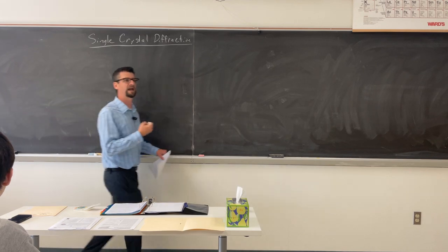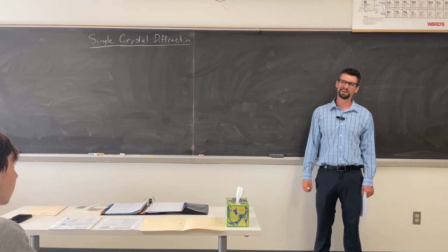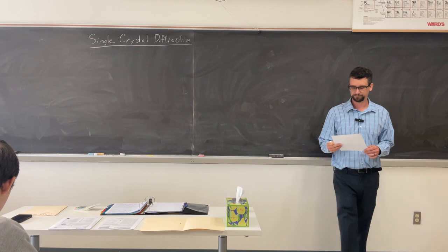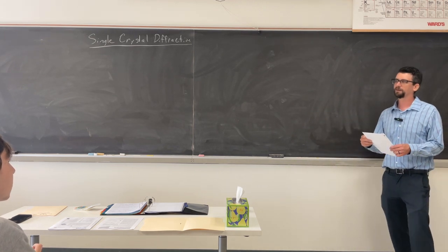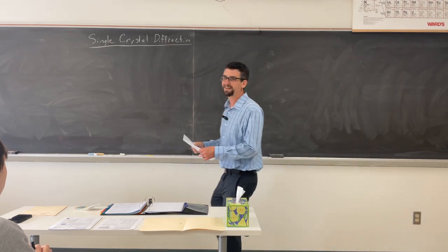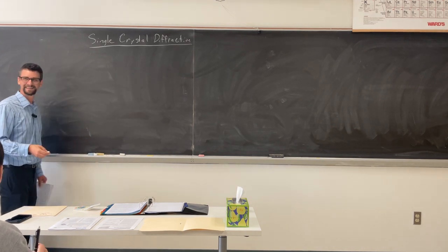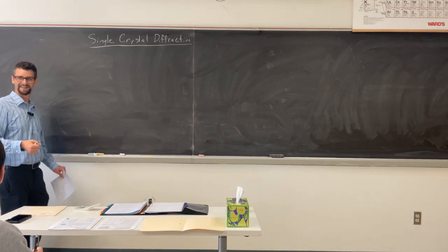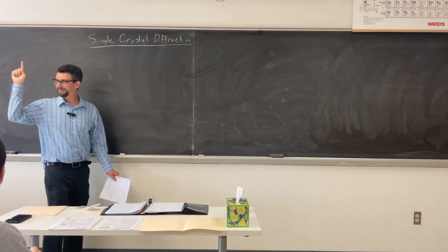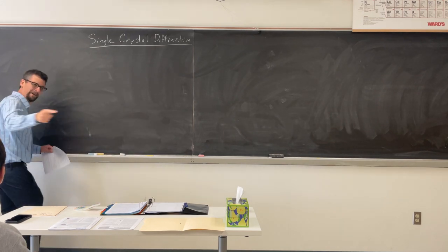We could do a schematic, but like the experiment, how do you summarize the experiment? Let's say I'm a business guy. It's going to cost you $2,000 to run this experiment, and I'm going to go, I don't know, I don't think it's worth it. Describe it to me. You can tell how the atoms in the crystal are aligned based on shooting a laser at it. Not a laser. X-rays. Yep. A beam of X-rays. Right. Totally not laser. When it hits electron density, it goes out in all these different directions, and that helps you determine. Yes. You got your $2,000. You got 1,750. You guys didn't answer. No money for you.